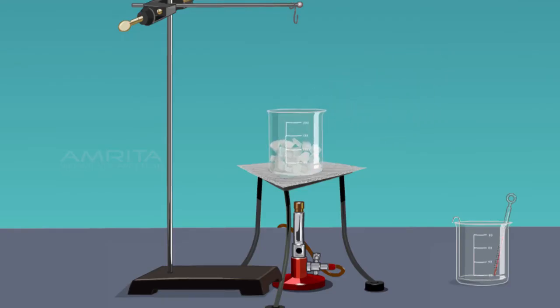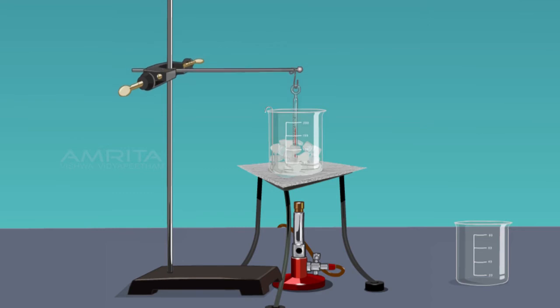Place the beaker on a wire gauze, keep it over a tripod stand and insert a stirrer into the beaker. Take a thermometer and suspend it with the help of a clamp stand so that its bulb remains in the middle of the ice cubes.